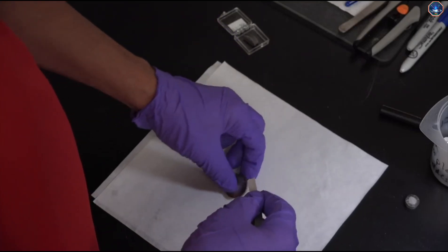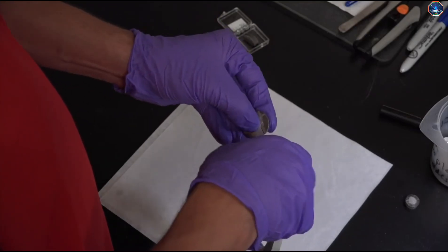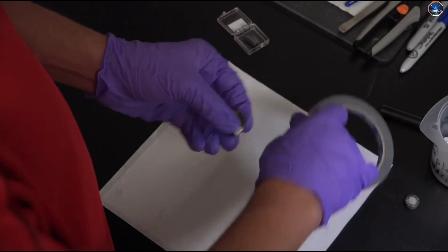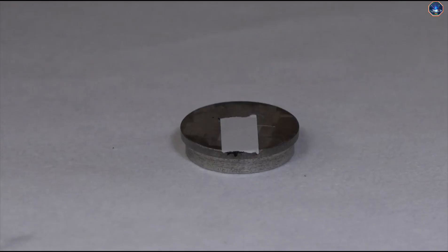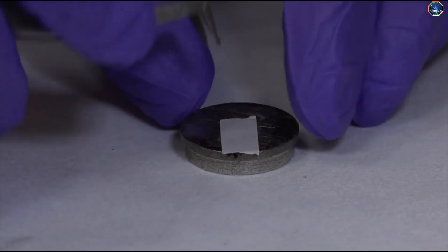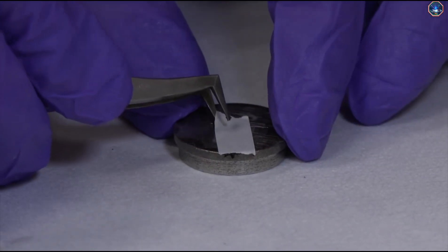Cut a small square of tape off the roll. The size of the tape cut out needs to be smaller than the area of the mount, but big enough to securely hold the sample. Place the piece of tape on the mount. Make sure the tape is lying flat on the mount. Now remove the paper covering the top side of the tape.